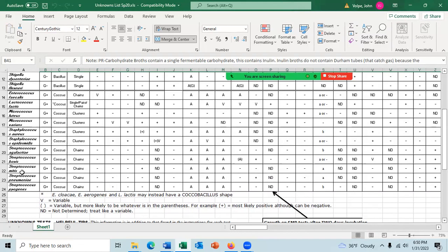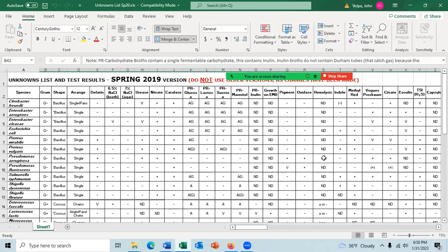There's about 23 of them. And these are most of the tests you can run on the top up here. And this table gives you the results for each species for each test.